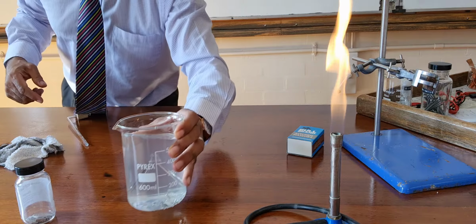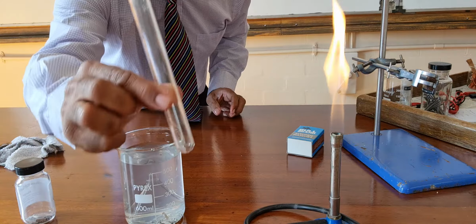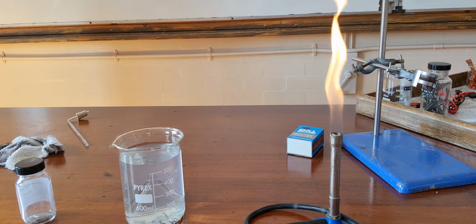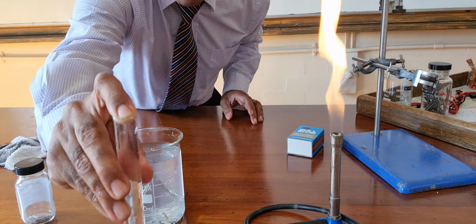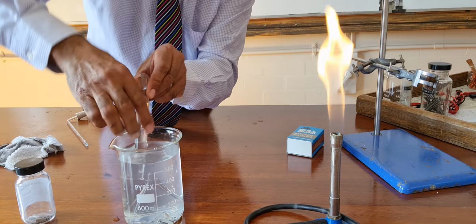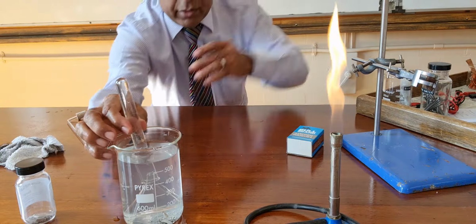I put more water in, top that up a bit. I'm going to get an empty test tube and fill it with tap water. Having filled it with tap water, I'm going to put my finger over the top. If I invert it and get it over the spout.